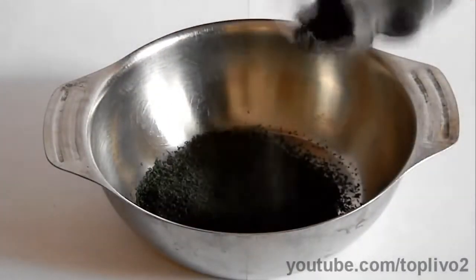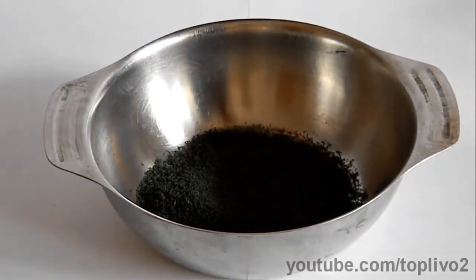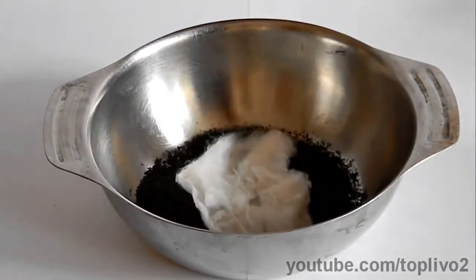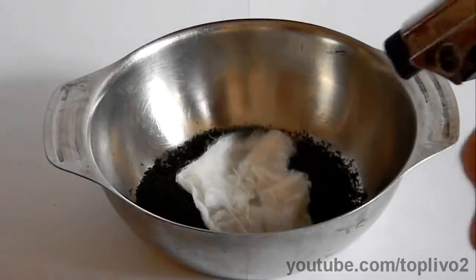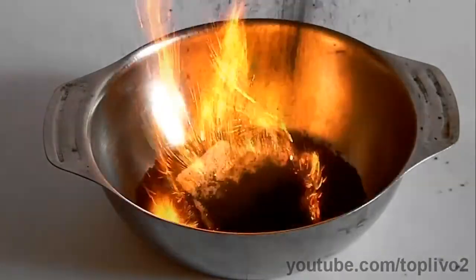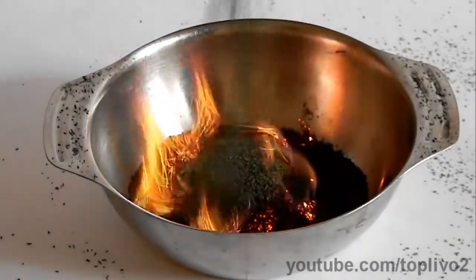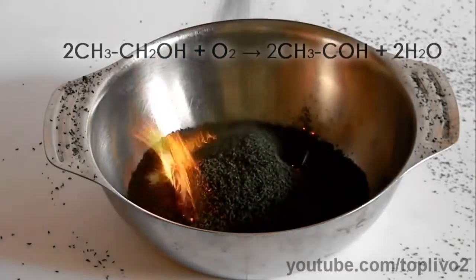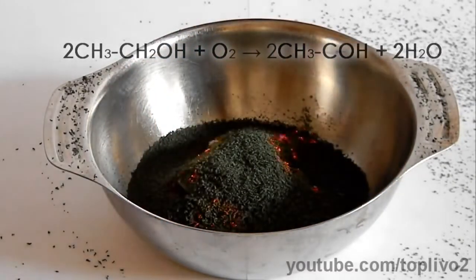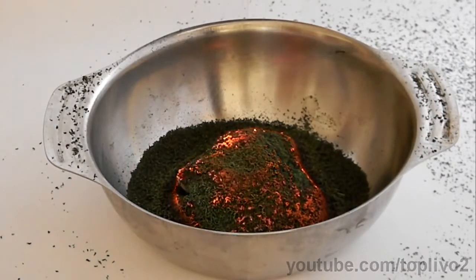For the next reaction, let's take a metal cup and pour a small amount of chromium oxide there. Place a piece of cotton wool soaked in ethyl alcohol into the cup, then ignite the cotton. Now quickly sprinkle the cotton wool with chromium oxide. During this reaction, chromium oxide catalyzes the oxidation of ethanol to acetaldehyde. By the way, the smell of acetaldehyde is very much like quick-drying superglue.